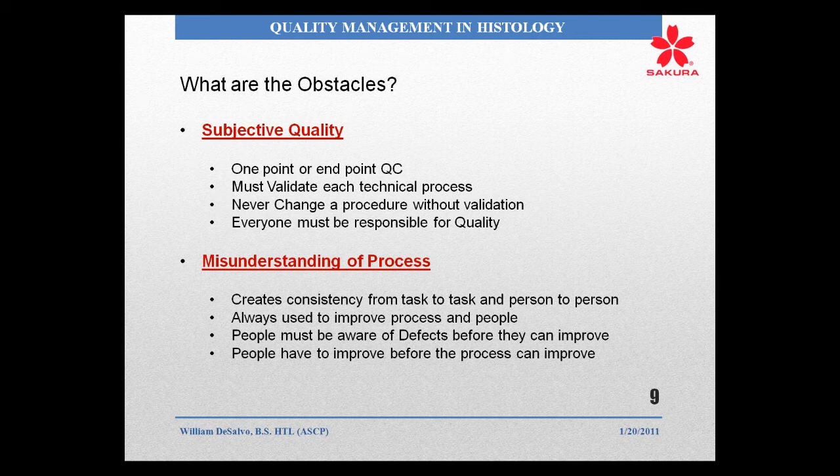You can't just interchange a solution. You can't just decide to make a change to timing or temperature or concentration without testing against the existing model that you have before you move to the new one.